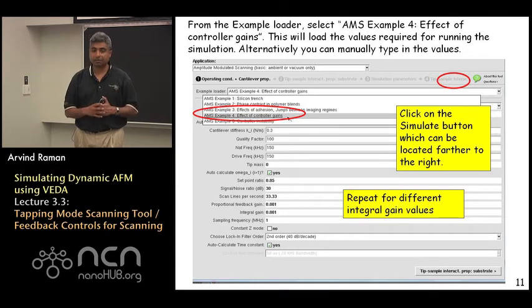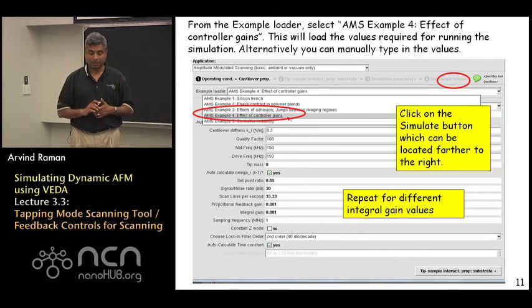So pretty much what you need to do is simply go to the operating conditions and try changing the integral and proportional values. In this particular case we are going to focus on integral gains.